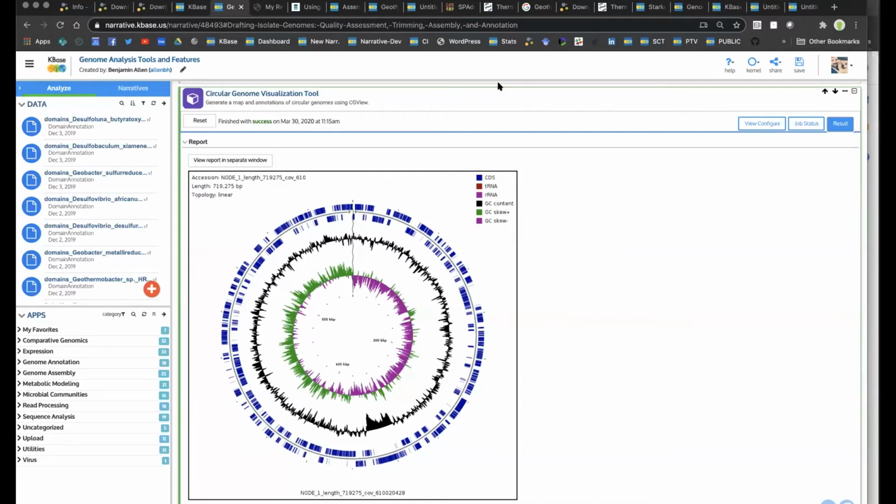And overall have kind of shown you some of the common tools that you'll use in a genome annotation workflow. I'm gonna pass it to Miriam for the next half hour, and she's gonna talk a little bit about some of the statistics and strategies in a little more detail for this workflow that I went through pretty quickly here. And then I'm going to come back and talk a little bit about publishing these tools.